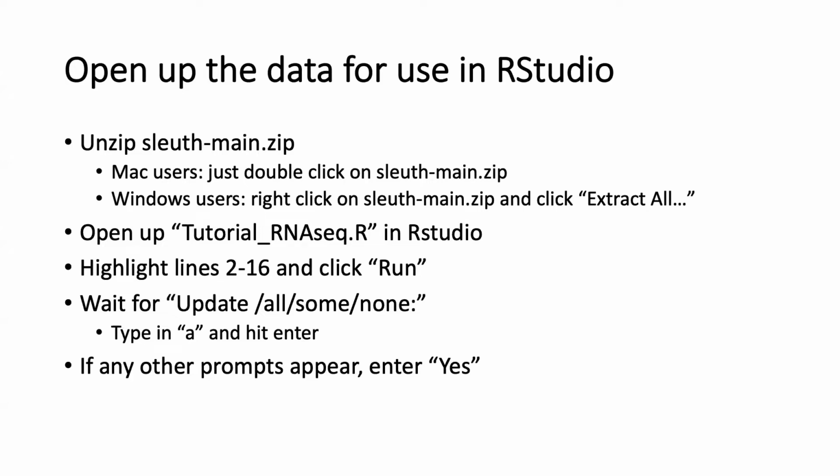Once that's unzipped, you can open up that folder and there should be a file in there called tutorial RNASeq.r. If you double click that and you have RStudio, it'll open up in your RStudio instance. Is everybody to that step yet? Got there? Okay.